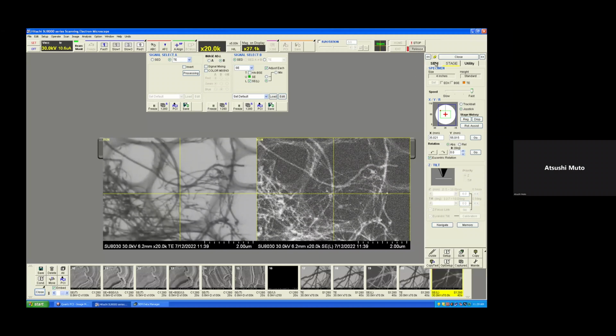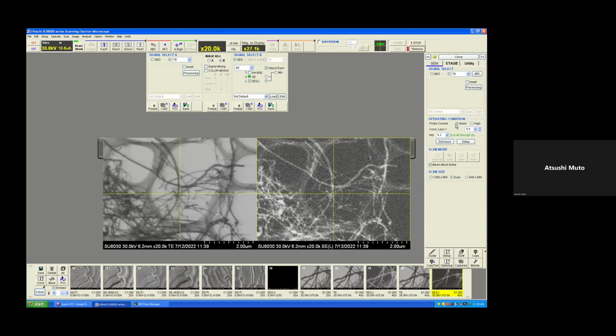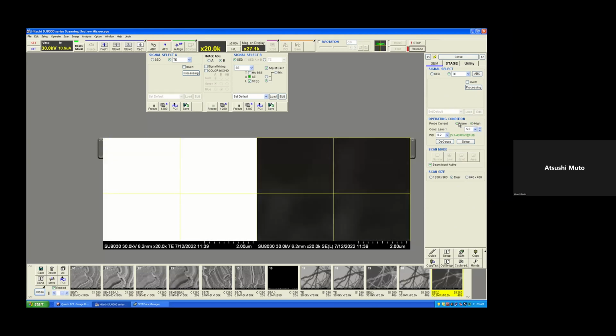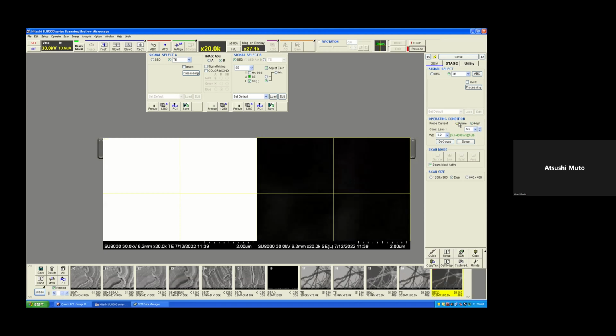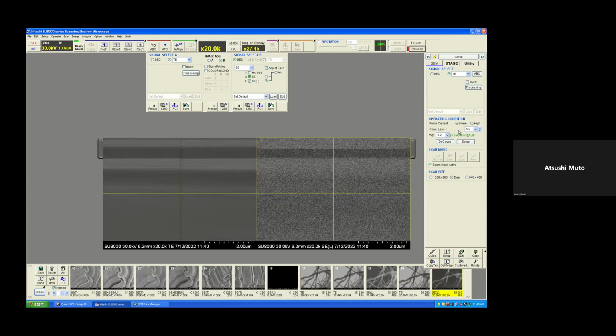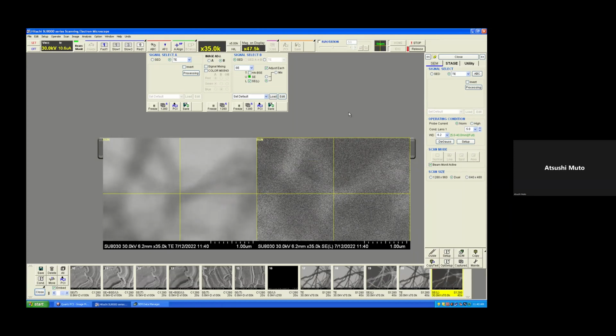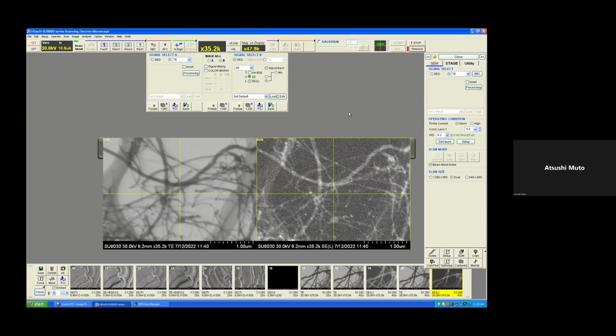And the next is the SEM side. Please change the probe current mode from high to normal. Actually, currently I'm using normal. If you use high mode, which is the normal condition you use for operation, the high probe current gives lots of current for a more comfortable operation, but loses resolution. If you'd like to maximize the resolution performance, please select the normal mode. Normal mode has stronger condenser lens excitation, focusing more on resolution settings.